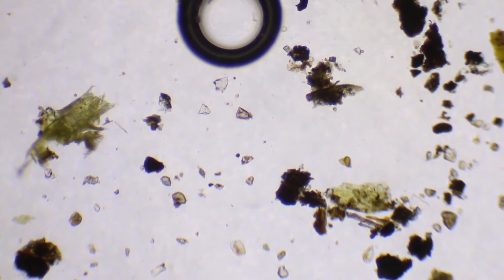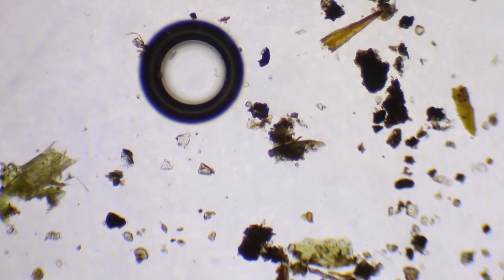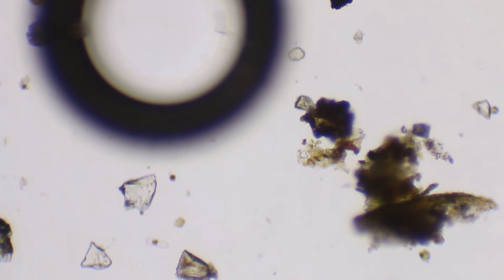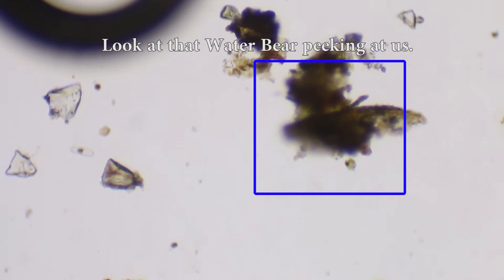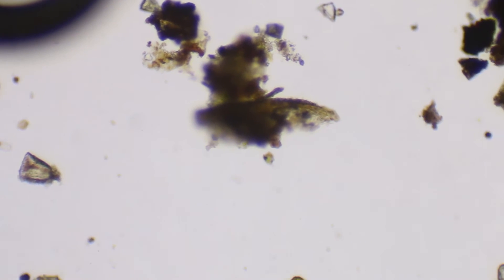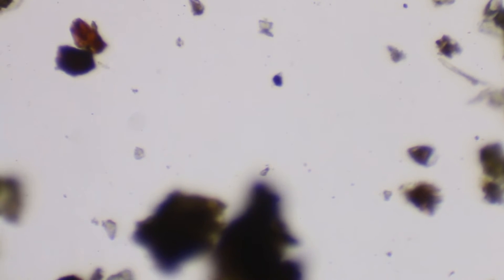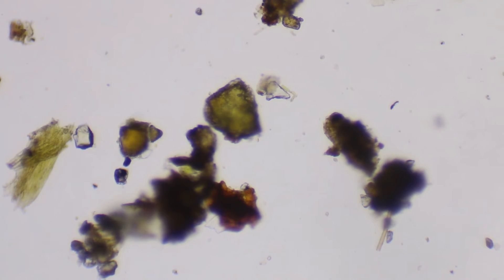Yeah! That's definitely a little closer than we were getting with the other setup. Well, there's something right there. You guys have to do science, because it's amazing. You see that guy right there? He's trying to eat that little piece. Let's look closer. It's making it wiggle — it's creepy. It's no centrifuge, but tapping the water dropper really helped to get some sediment down there.